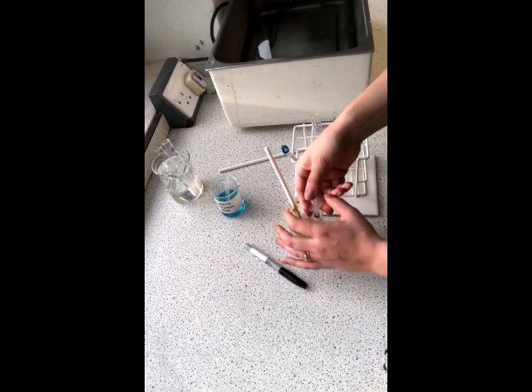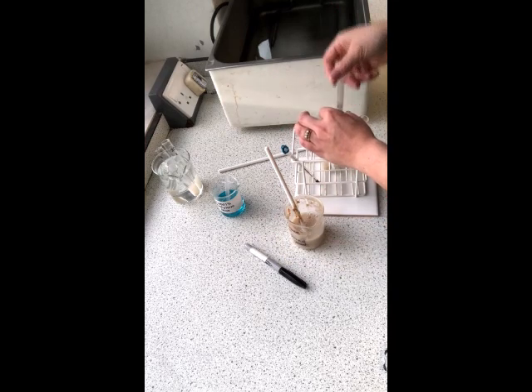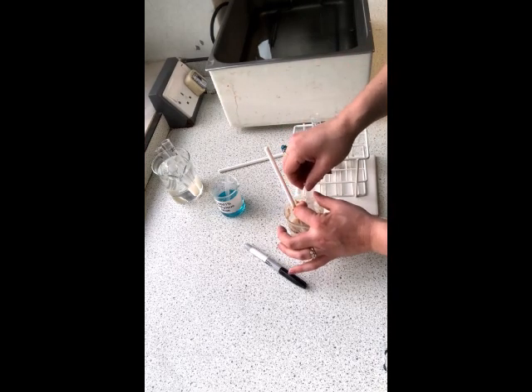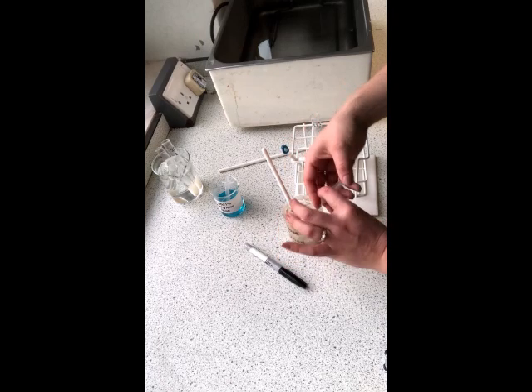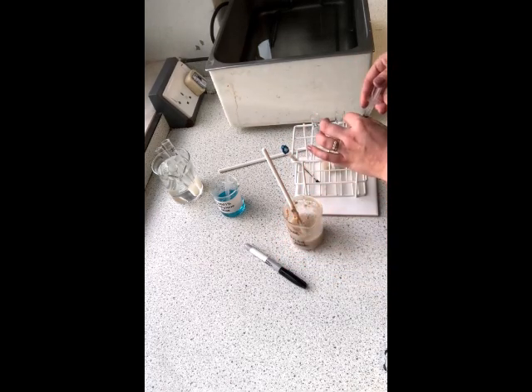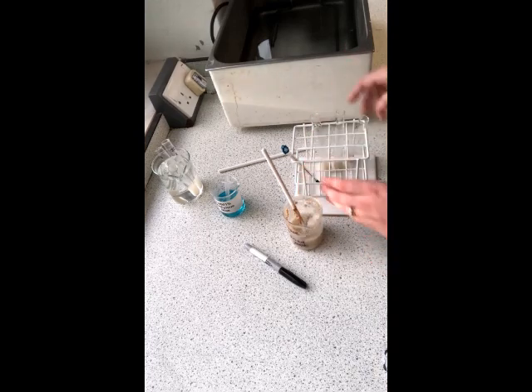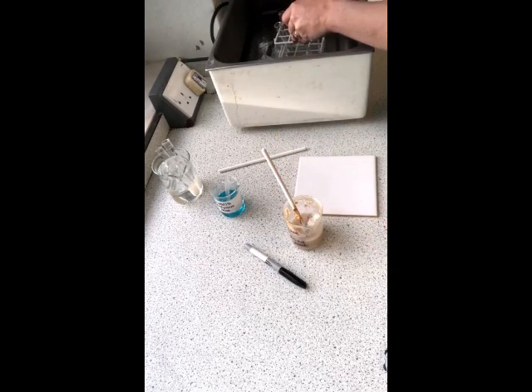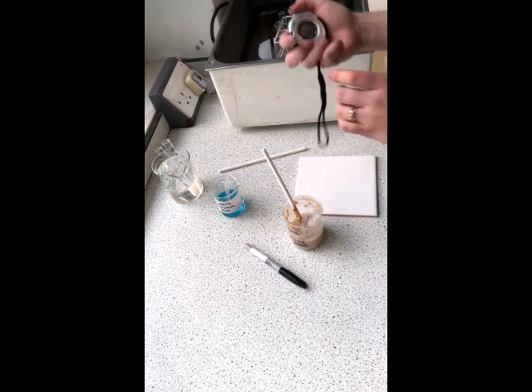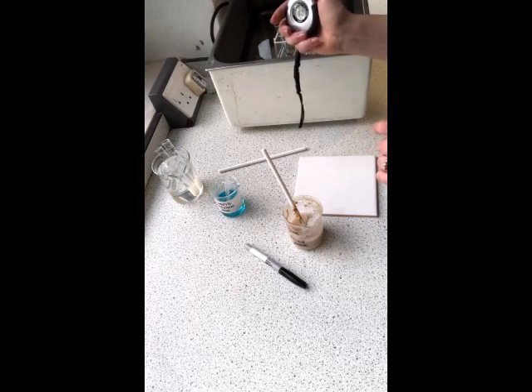Okay, yep, that's 2. And check that. Yep. Okay, and again we're going to carefully pop this into the water bath with our thermometer, and we're going to leave that for 5 minutes.